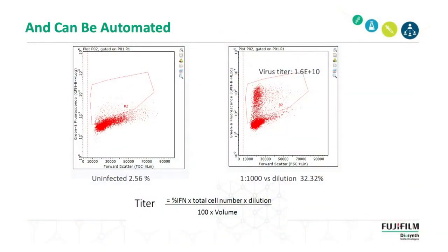But the fluorescence assay has an even better application, that you can automate it. So you can use this in a FACS machine. You can get very good estimates of the number of infected cells very quickly, because rather than screening just those snapshot pictures where you're physically counting, you can now shoot thousands and thousands of cells through the FACS machine, and get much more robust numbers.